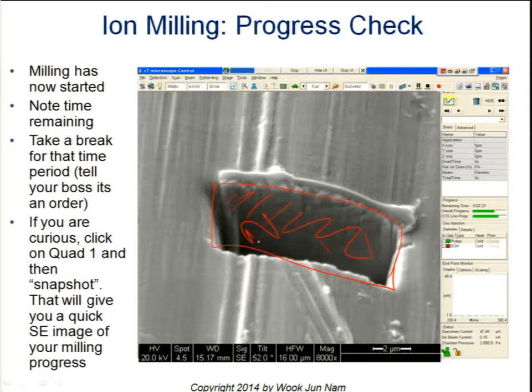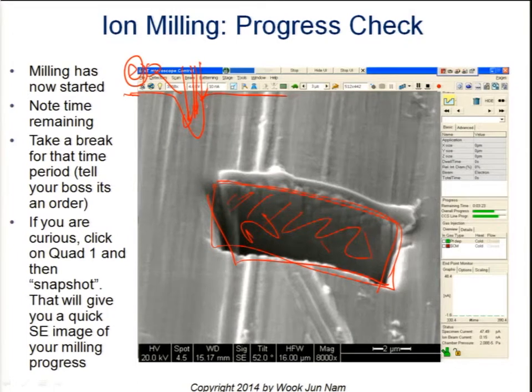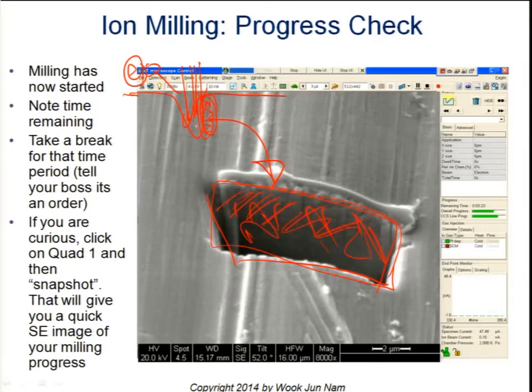That's because for this kind of initial cutting, you use pretty high energetic ions. So when the ions do the physical bombardment and sputter out the substrate, they also laterally damage this side. That is why this area, what you are seeing right now, is a little bit blurry, because this side is very roughly sputtered out.